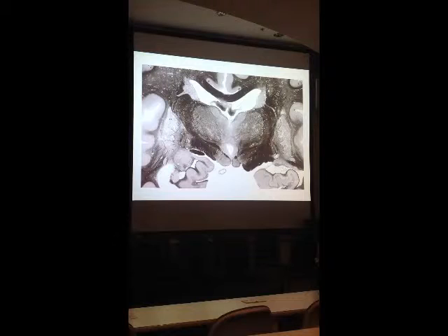And again, I think the final thing would be part of the temporal lobe with some cortical tissue that's in the floor of the inferior horn of the lateral ventricle. So technically, this is part of the hippocampus or the hippocampal formation. So again, the major thing on this slide would be mostly just identifying the major structures.